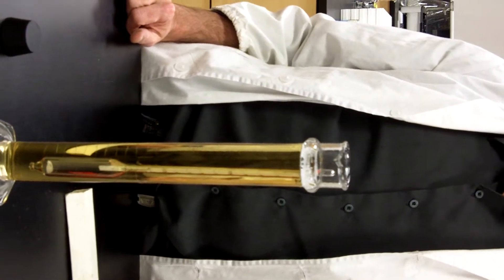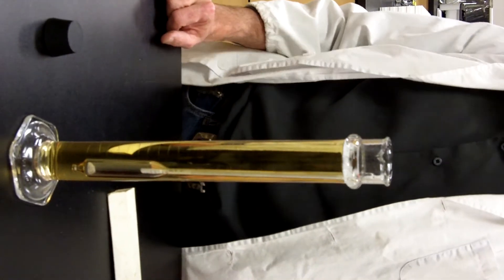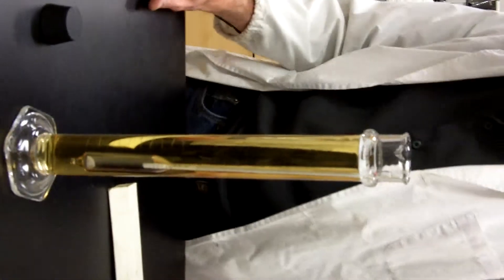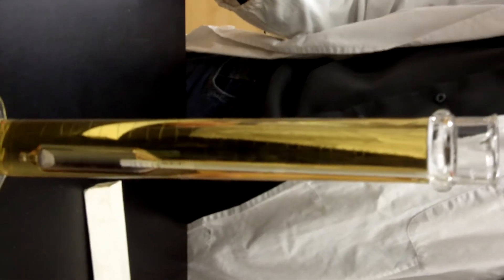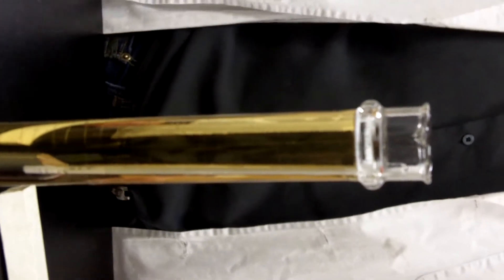And then what you do is you wait for it to stabilize. And you'll read off the specific gravity from the scale, which is on the side of the hydrometer. So you can read that and record the results.